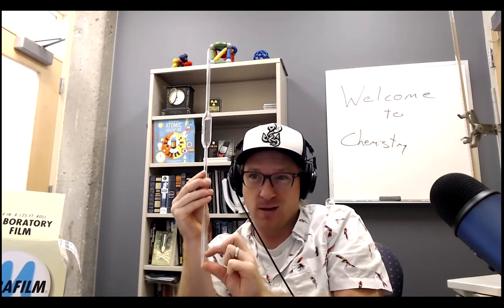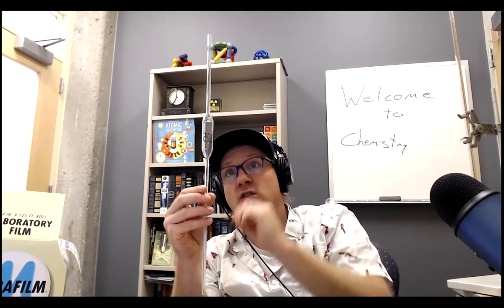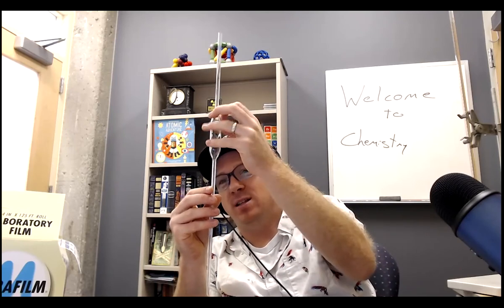Once it gets down to about here, you will notice that the last drop stays in the tip, and it's by design. It feels weird, but these are called "to deliver." What they do is deliver exactly 25 milliliters. There'll be some droplets coated on the inside here, but again, that's part of it.